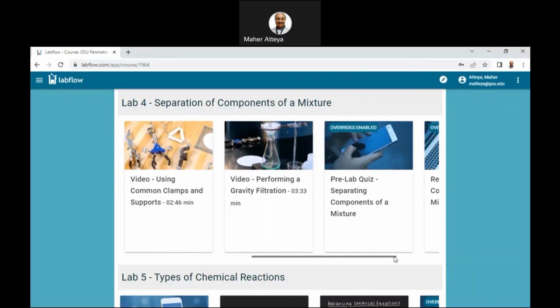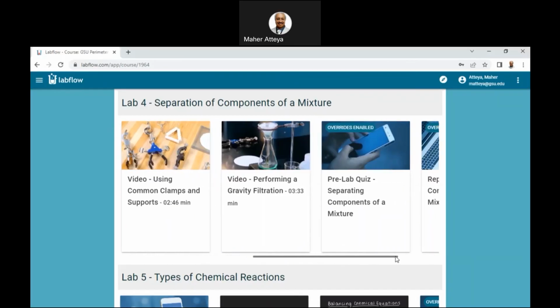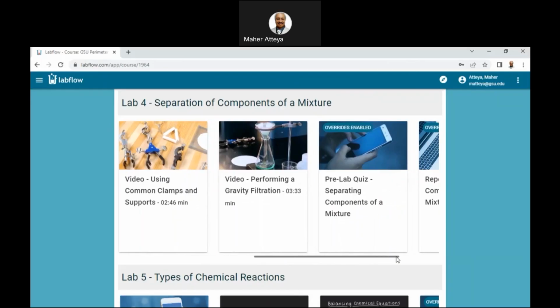We need to take another 3 here. So let me take another 3 here. New, take another 3. Copying this, pasting into our lab report.